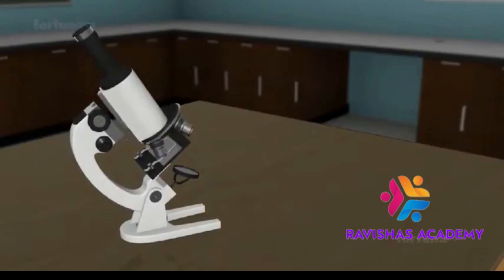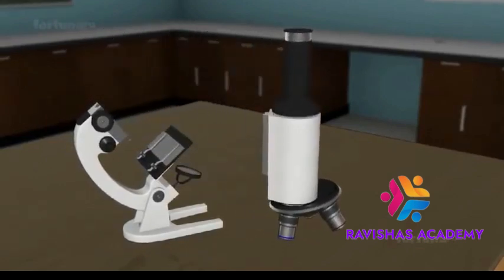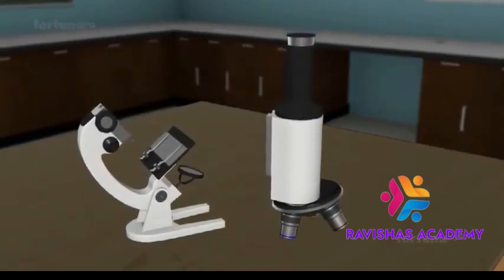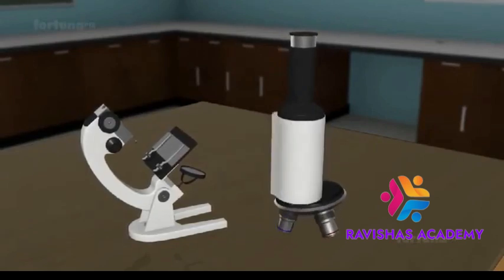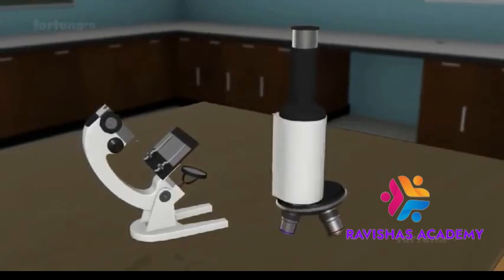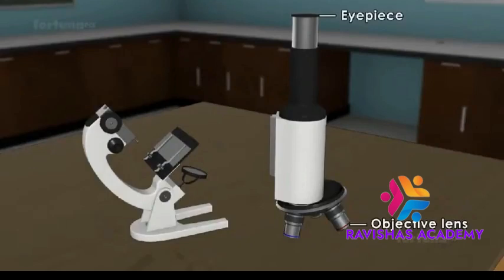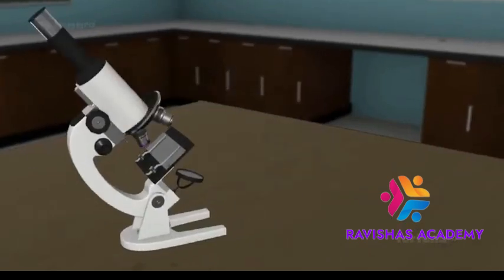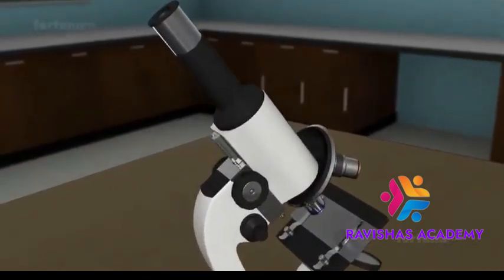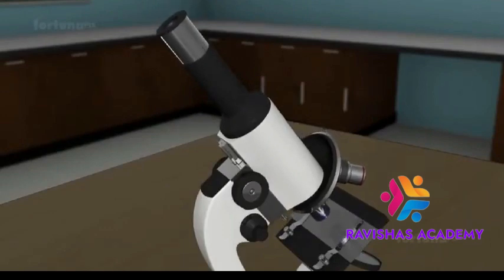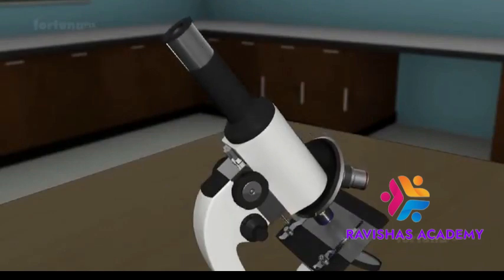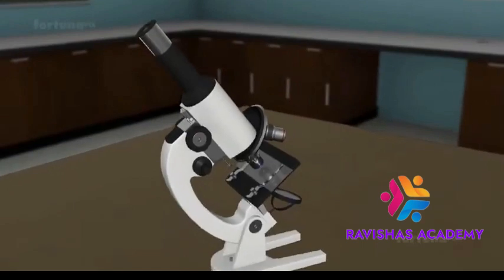The body tube is comprised of two smaller telescoping tubes with lenses coaxially mounted at either end. The wider tube holds the objective lens while the narrow tube holds the eyepiece. The knobs for both coarse and fine adjustment allow the tubes to slide one into another, varying the distance between the two lenses.